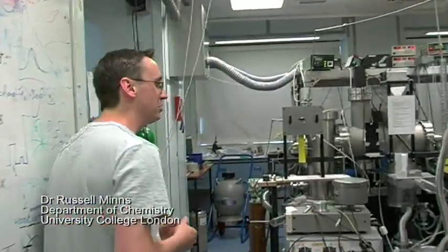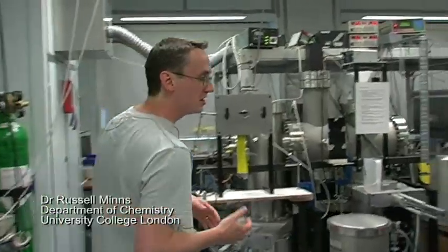This is the Ultrafast Dynamics Lab here at UCL, and what we try to do is use ultrafast laser pulses to look at reaction dynamics as they actually happen.